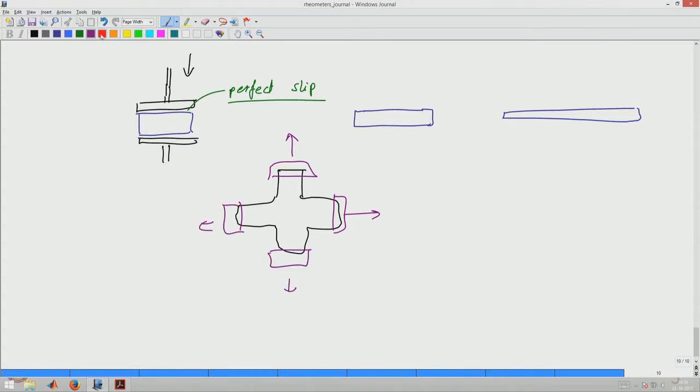So, the central region will have biaxial stretching. Therefore, multiple direction multiaxial stretching is also possible. Of course, this can be done for more of a film like sample. If you have melt, then this may not be easier to do. So, depending on the types of samples and depending on what materials we are interested in, different types of setups can be used for the multiaxial stretching approach.